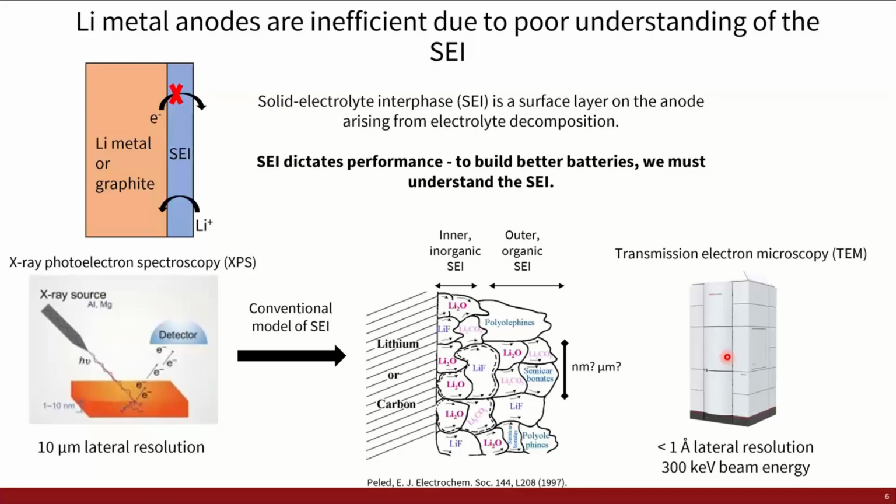So it's useful for high-end characterization of your SEI if you're really trying to understand what's happening within your SEI, the structure and chemistry of different components. But I do recognize it is less established than XPS and maybe less accessible to many institutions.